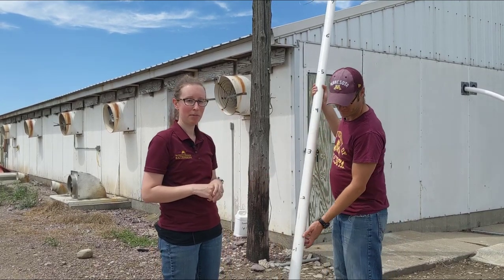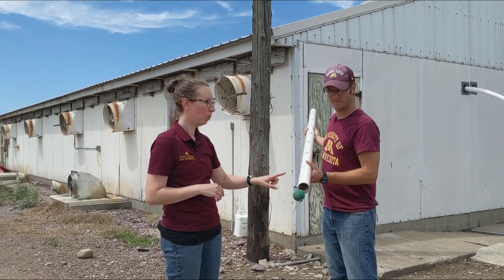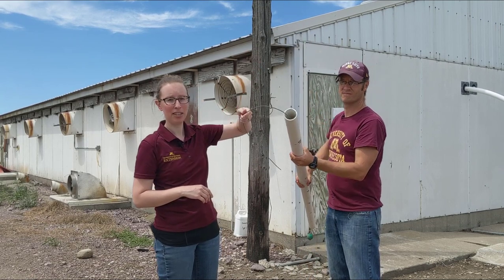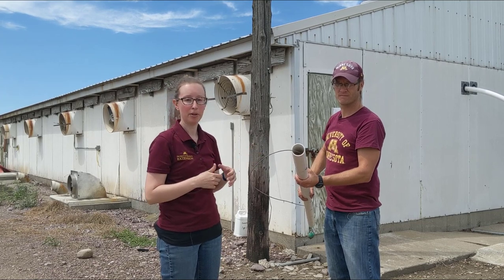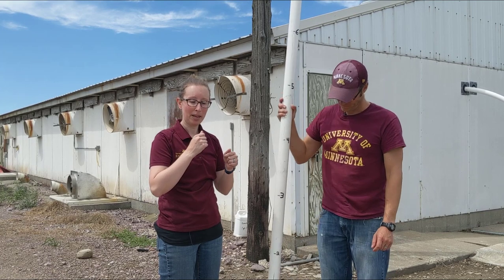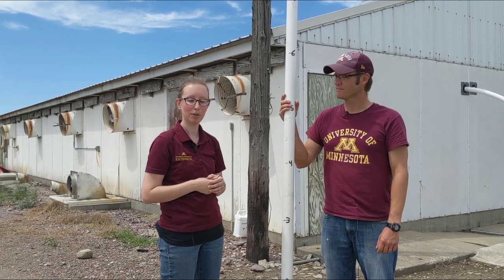What we have on the bottom of this PVC pipe is a rubber ball. This rubber ball is attached to a wire that goes the whole way to the top of the pipe, where there's some extra slack so that once you get this down into the pit, you can pull it shut so that the rubber ball will trap all the manure inside the PVC pipe. Then you can lift it up out of the pit and empty it into a bucket, mix it really well, and get your sample from there.